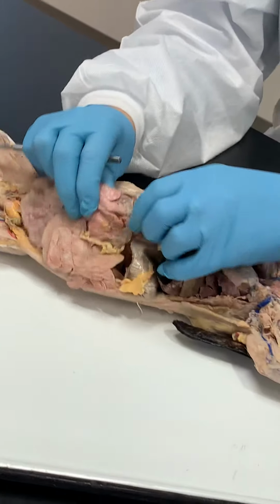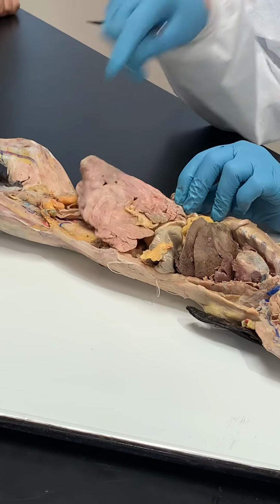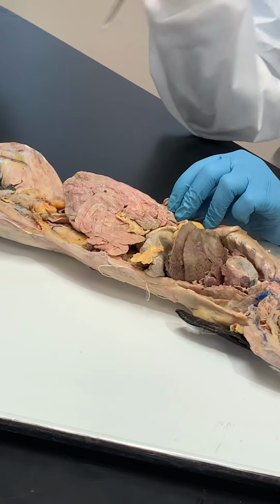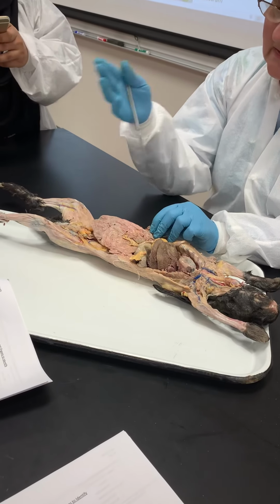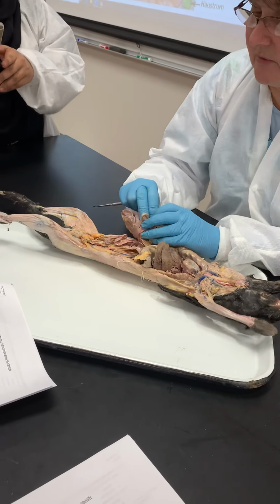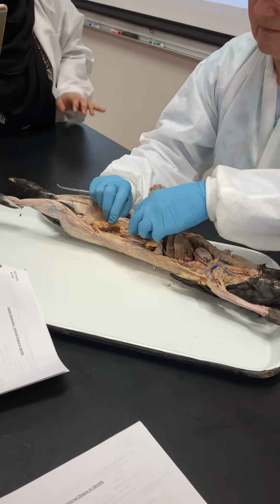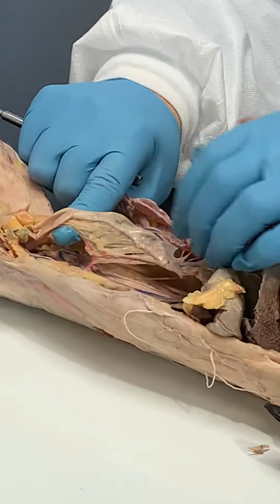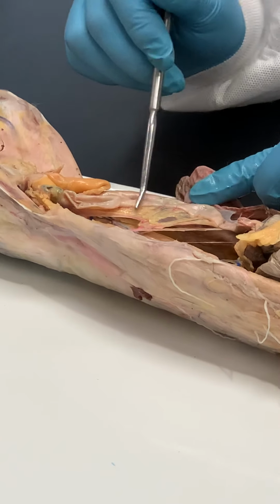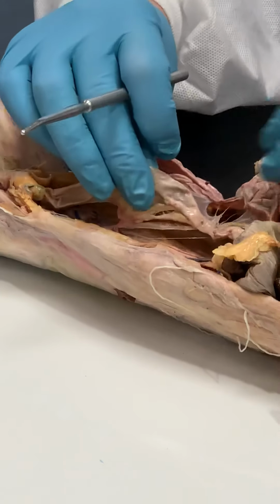And it's a big old plethora here of intestine going every which way because this is a herbivore. Herbivores have longer intestinal tracts than carnivores or omnivores, and that's partly the cecum and the length needed to break down plant material. Okay, let's go backwards. Here is your colon, descending colon right here. Do you see the mesocolon? These membranes here? Remember the inferior mesenteric membrane? Right, that's a mesocolon right there.